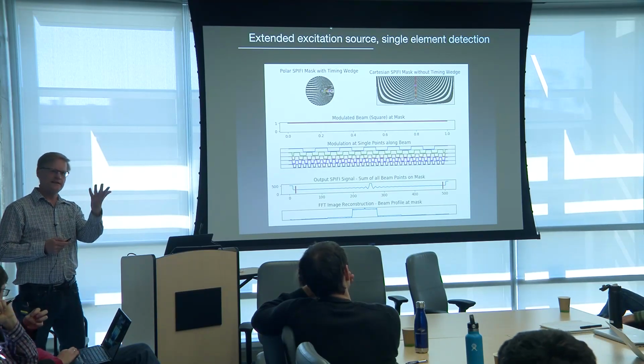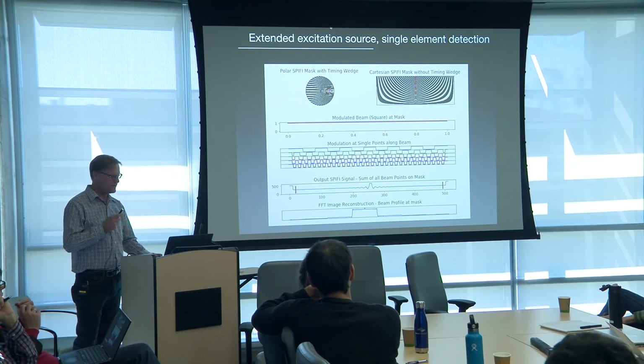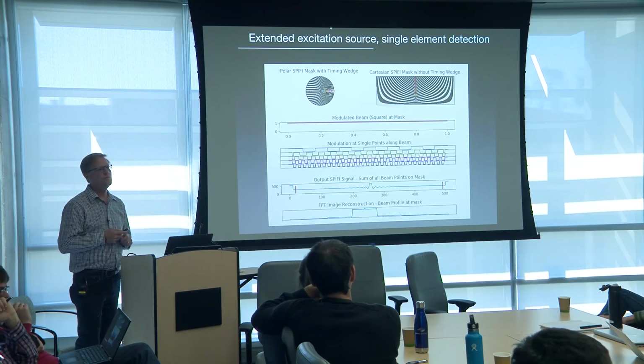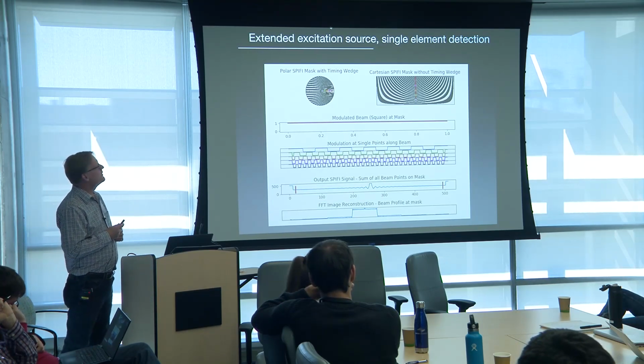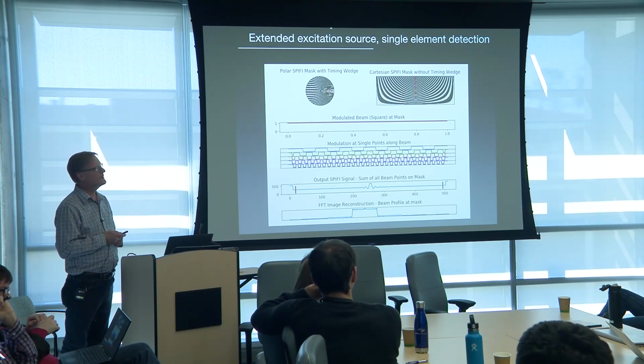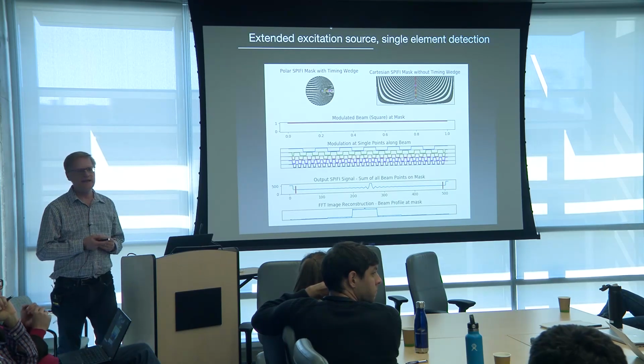Then you move it around, and you reconstruct. That's right. So just like you would raster a point, but now we're rastering a line. So you really need the disk to finish one round of operation to flash up an image. Can you use just a quarter of the disk? Yeah, absolutely.